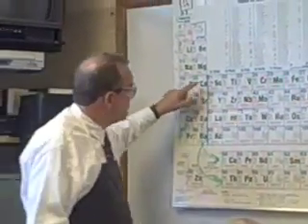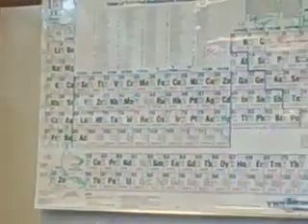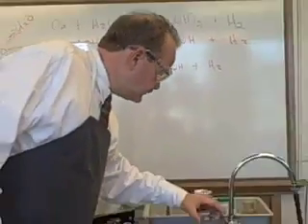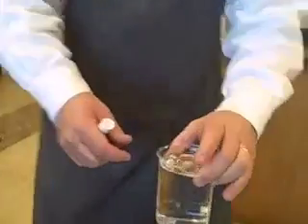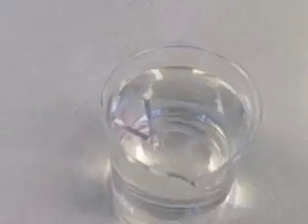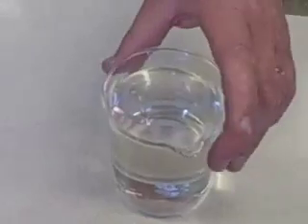At the beginning, I put some magnesium in my little beaker. And yet, I don't know if you've noticed it or not, but nothing's really happened with this magnesium. Except if you look down on it, there's actually just a little bit of pink that's forming around the magnesium ribbons. So what's that mean? The magnesium is slowly reacting with the water in the same way that all these other metals did. It's just a very slow reaction because it's not as chemically active. So would that make sense based on the trend that we're establishing here?